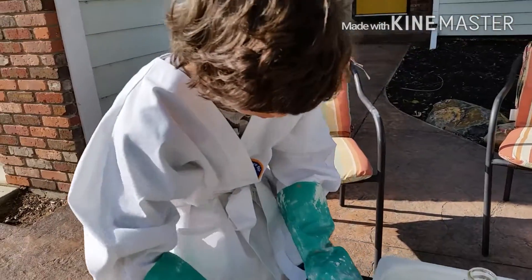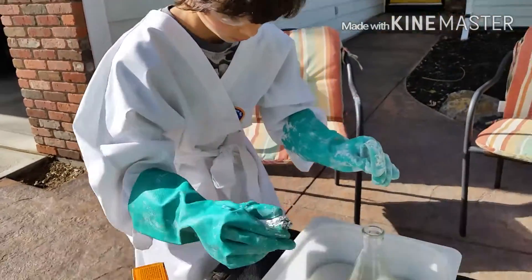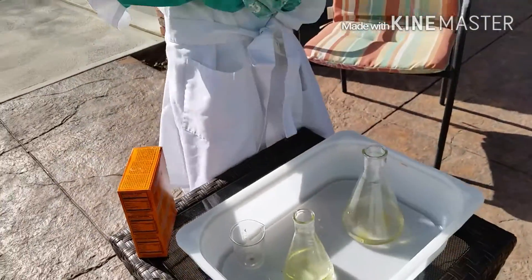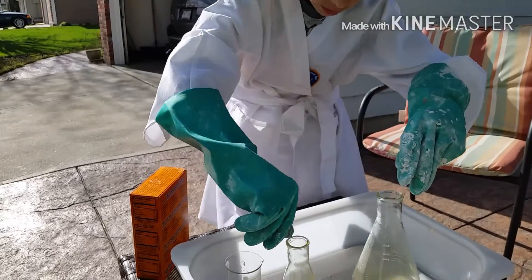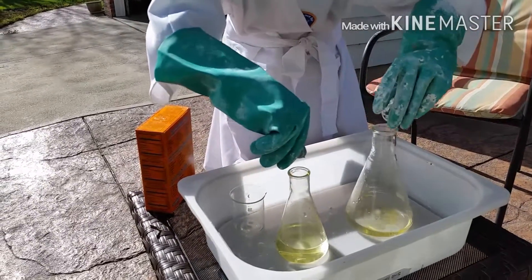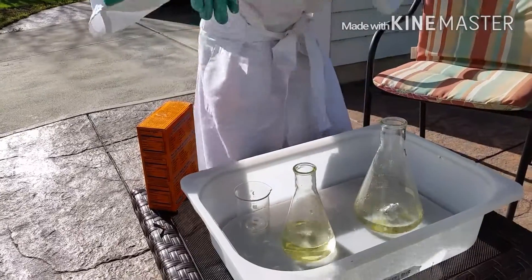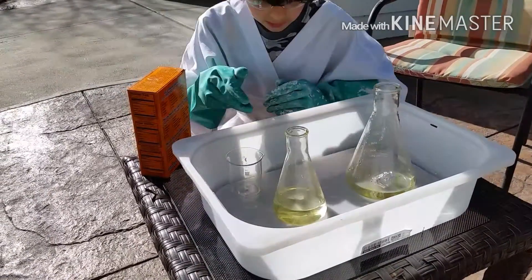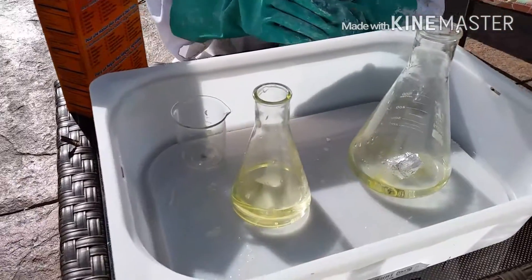I'm going to put them in in three, two, one. Looks like this one's bubbling faster so far, but this one has bigger bubbles.